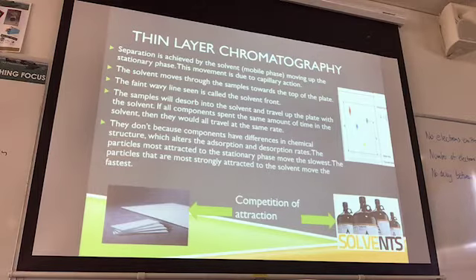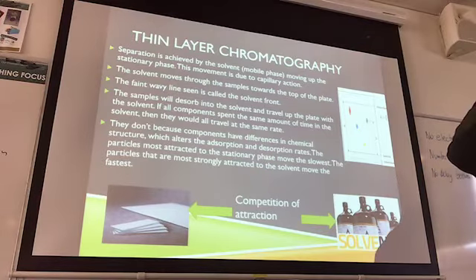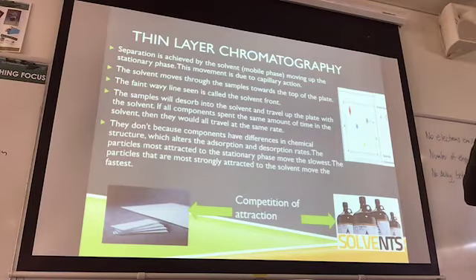So if you had something that was perfectly dissolved in the solvent and wasn't being adsorbed to the stationary phase, then the solvent front is where you would end up with your analyte. But that generally won't happen. So it moves up.